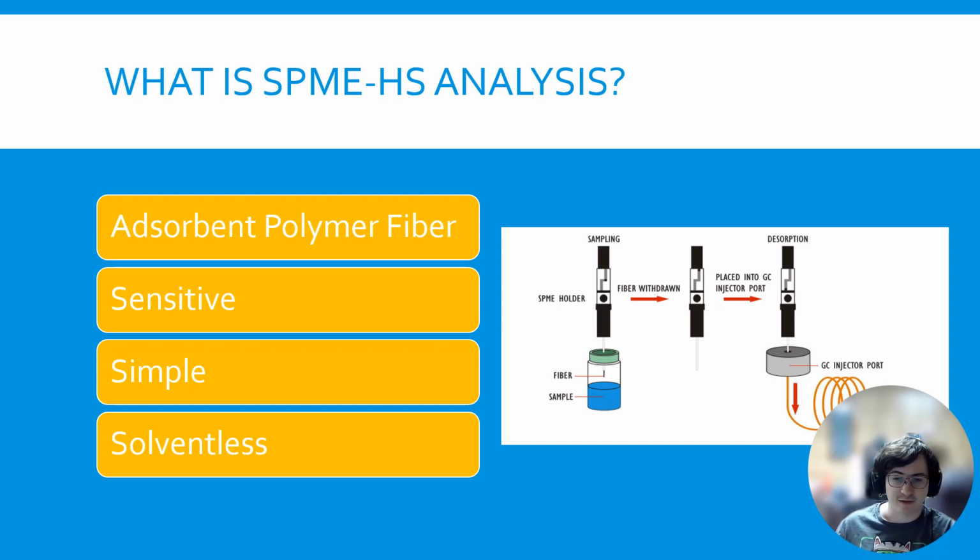It just relies on equilibrium constants, like a liquid extraction would too, like how a compound would prefer to be in one liquid over the other. It uses how the chemical potential would push it up into the headspace, and then from the headspace, some of that will want to go to the fiber in an equilibrium, and then we can detect that later.